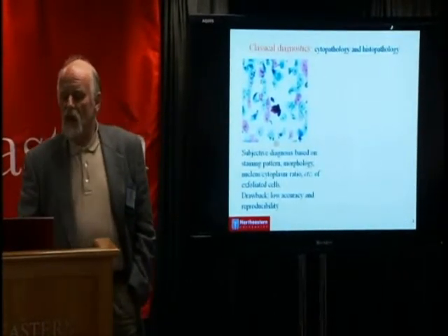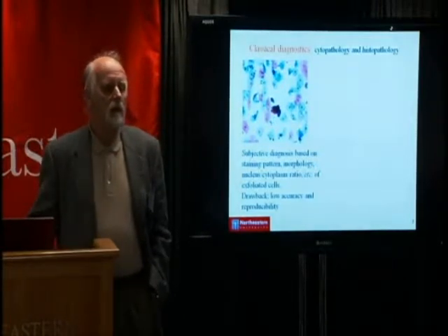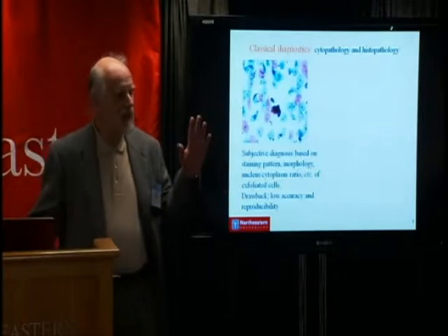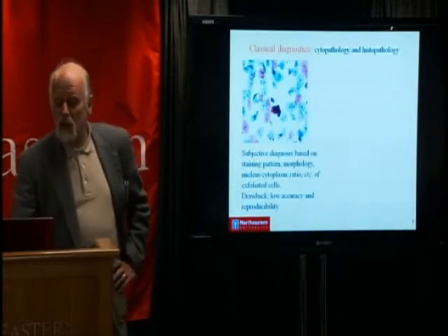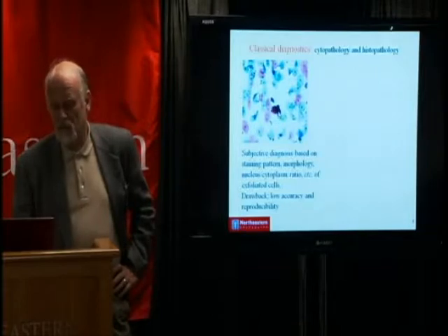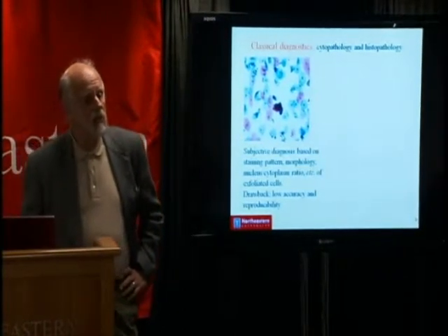And here a cytologist looks at a deposit of about 10,000 cells on a slide. And the pathologist looks at 3 or 4 cells which are abnormal. So just the chance of finding 3 or 10 out of 10,000 is pretty slim. And what they're actually looking for is not that ugly clump here, which is actually just lymphocytes. It is actually this particular cell down here, which you can see, which has a larger nucleus.